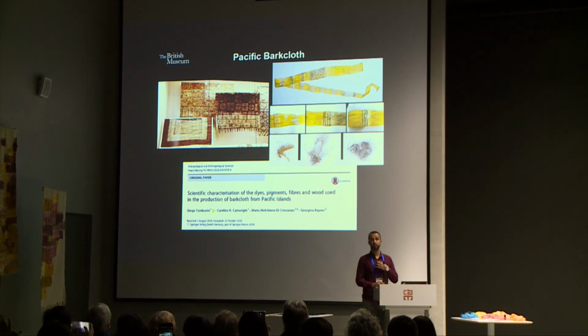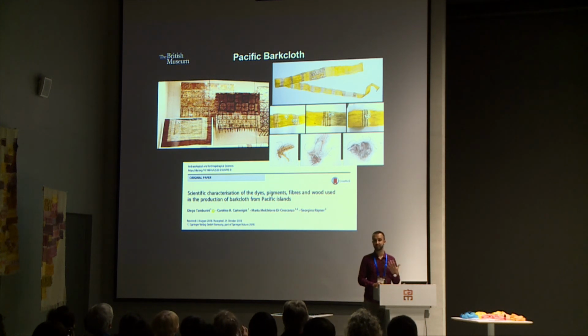And finally, we also did something very similar on Pacific bark cloth. And again, completely different reference materials. The dyes are different, but the approach that you can use from an analytical point of view can be similar.